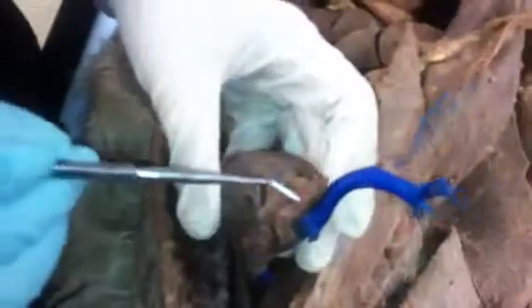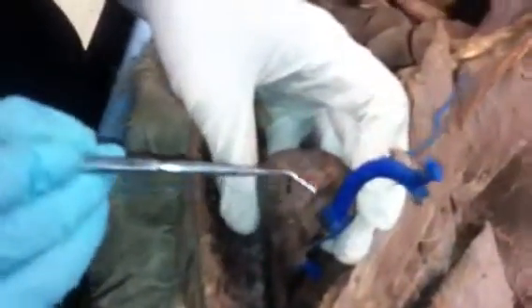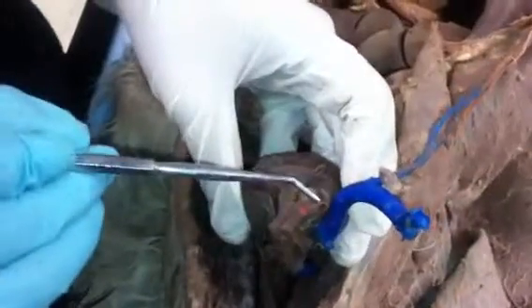Ready? Okay. The left subclavian artery is this one, the small one that goes into the aorta, and then this is the right one. The lesser omentum is in the stomach right here. It's the kind of connection in the stomach. I think that covers it.